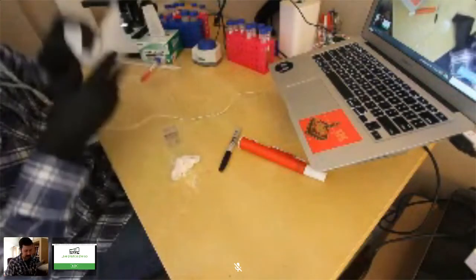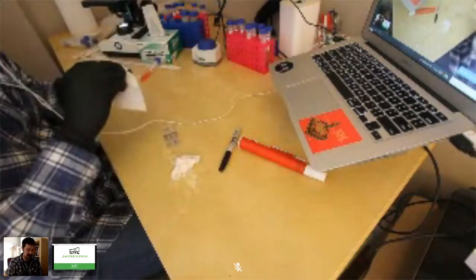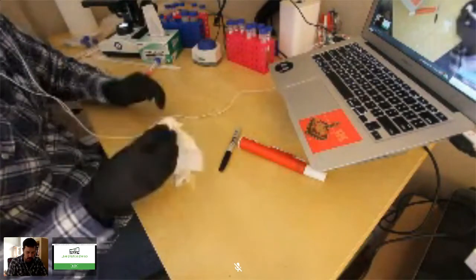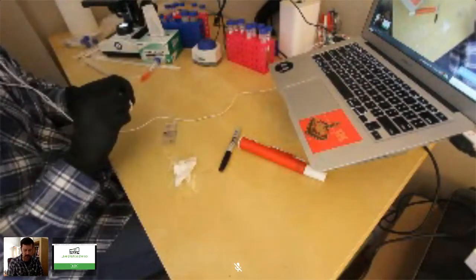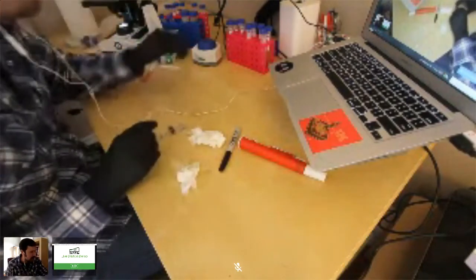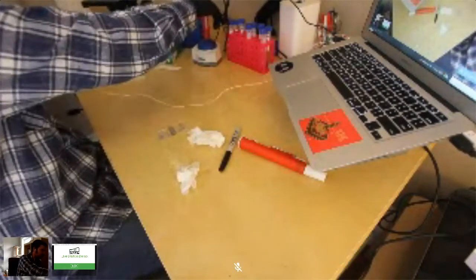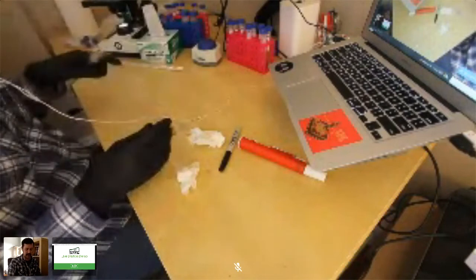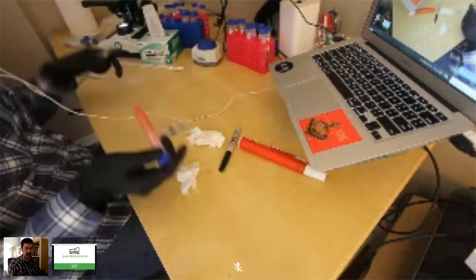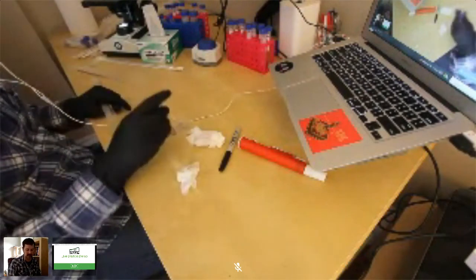For loading your pipette, this is where working with these 1 mil tips is a bit of a pain. It's going to be really hard to load onto the chamber accurately. These chambers are designed to take 10 microliters. And if you load more than that, you'll end up flooding the chamber. What you can do is load 2 samples on this. So if let's say you're counting 4 harvests, you can shorten your time by loading 1 sample onto each.